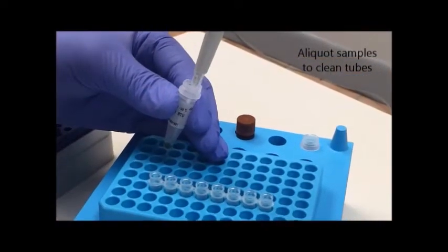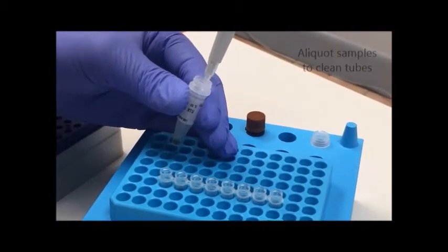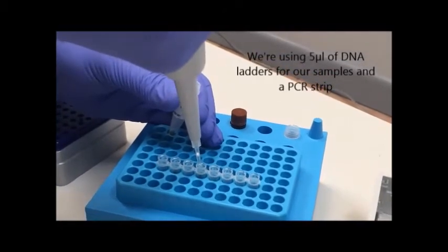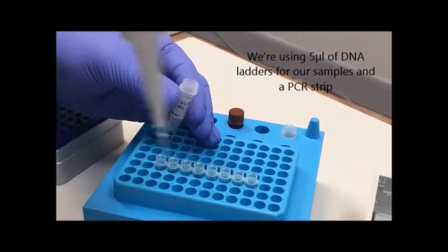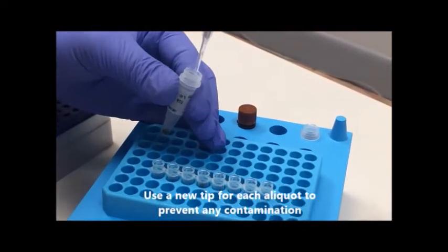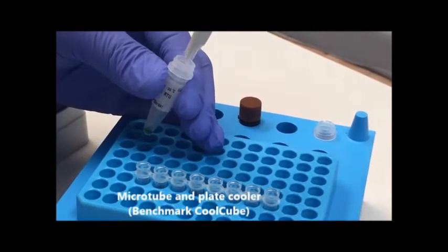The reagents we are using for this demonstration are two different types of DNA markers and some DNA stain. Here we are going to pipette 5 microliters of our DNA marker into clean tubes. In this case, we are using a PCR strip so we have 8 tubes to work with.